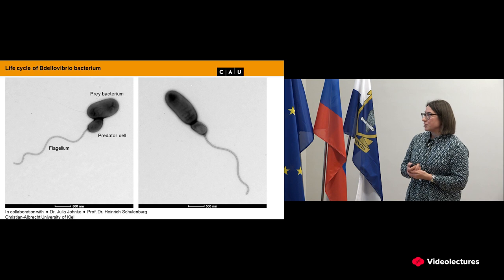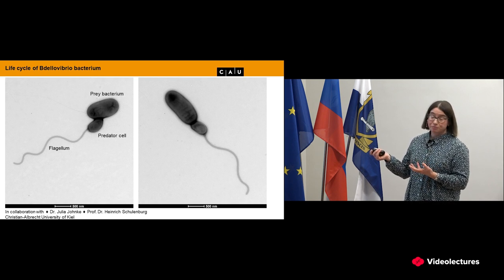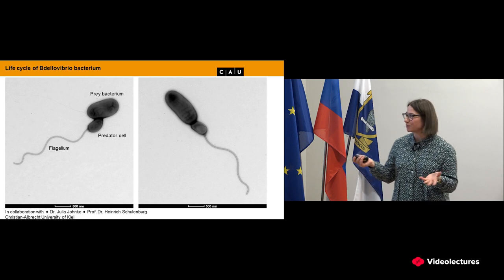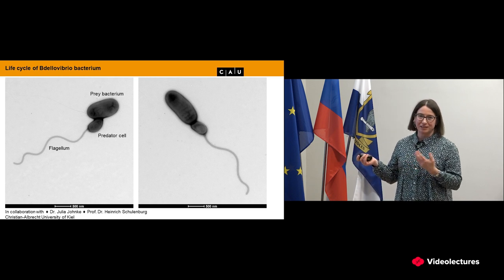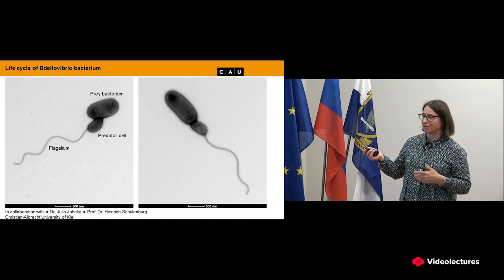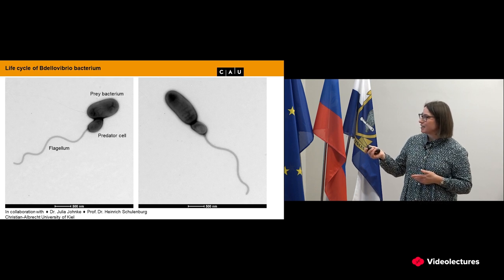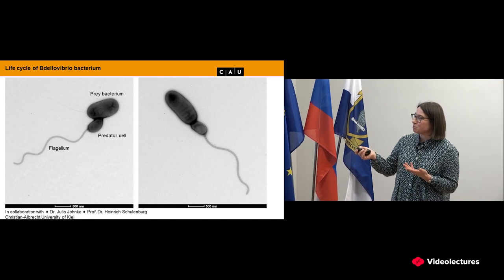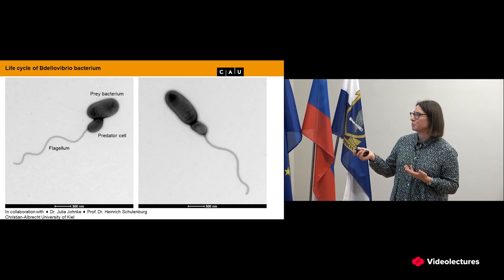It also works with bacteria, but you can already see that these bacteria look darker. We just basically see the shadow. And I find it fascinating, probably most of you don't know, there are also predator bacteria. They have a big, thick flagellum. They swim and they prey on E. coli or Pseudomonas, and they attach to them. We believe we see this here, this bacterium called Bdellovibrio.